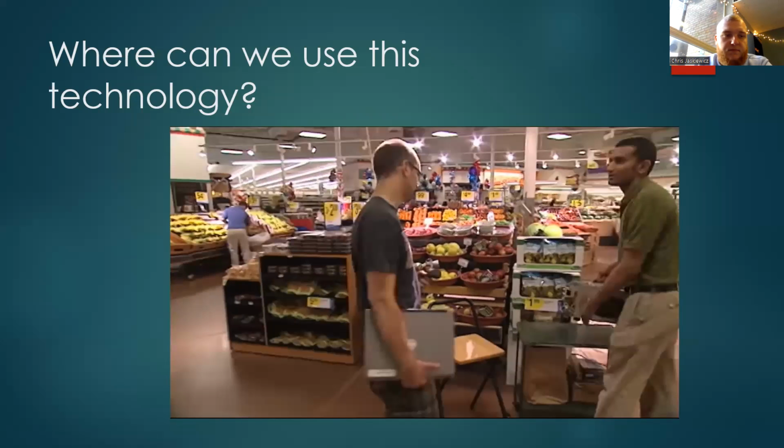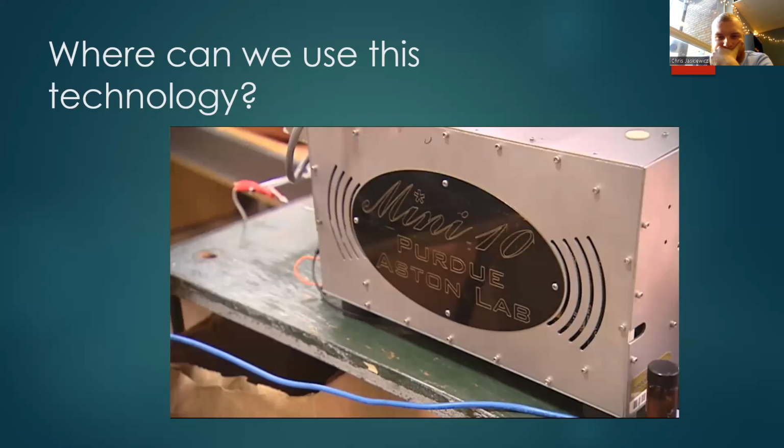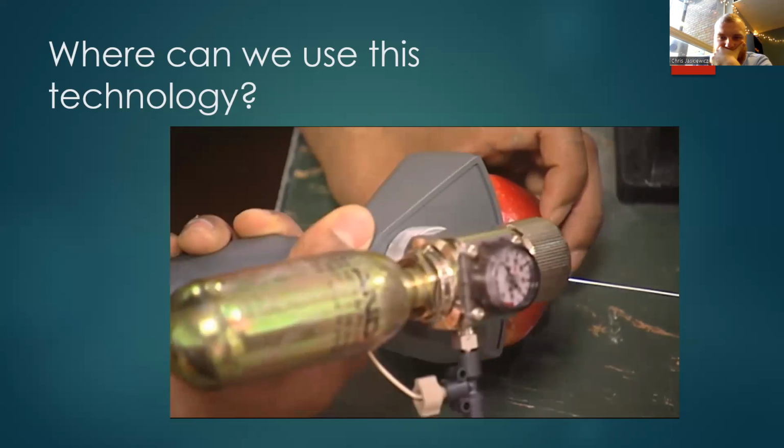University just built a handheld device that can quickly analyze. Their miniature mass spectrometer has already been deployed to detect.